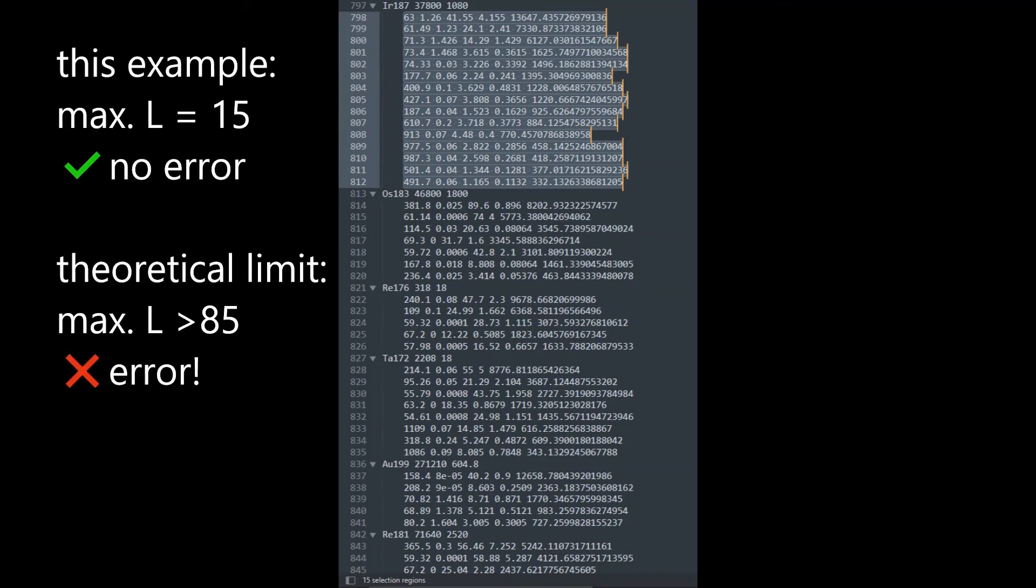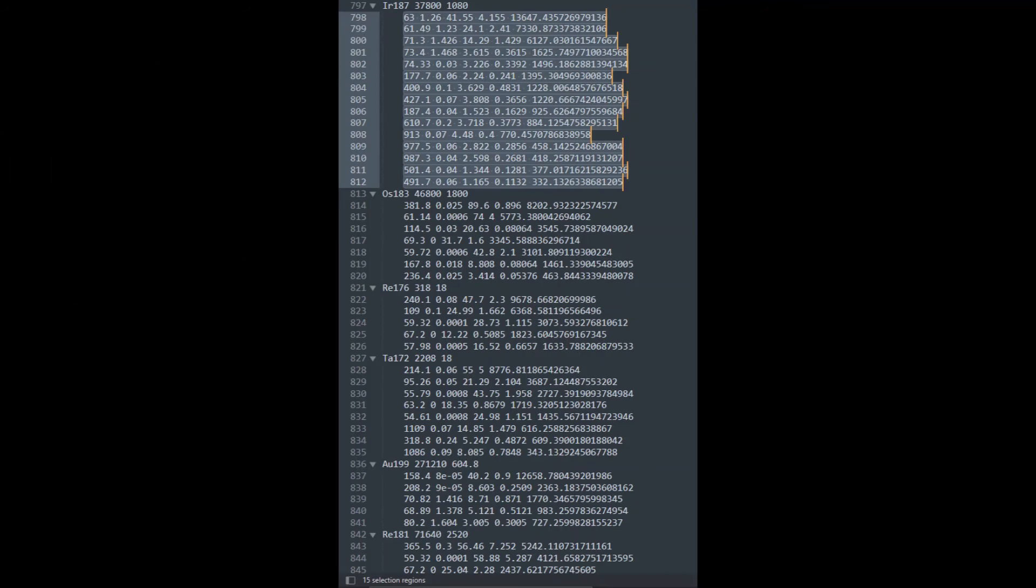But if the widest nuclide has more than 85 lines, then step four would sporadically print out the too many nuclide lines error message and the process will fail.